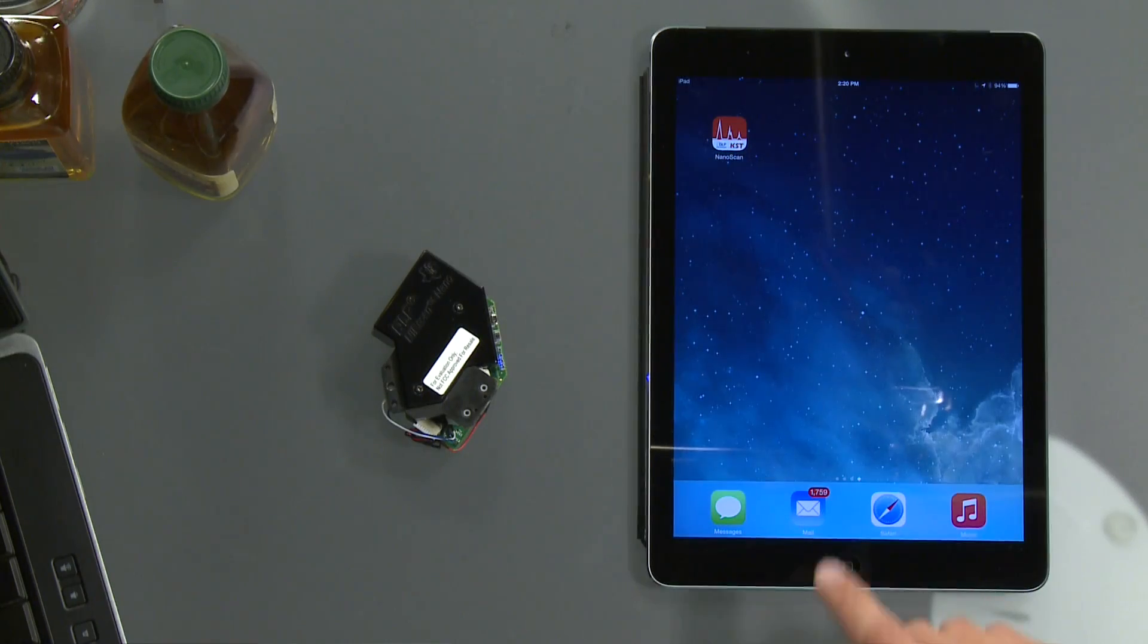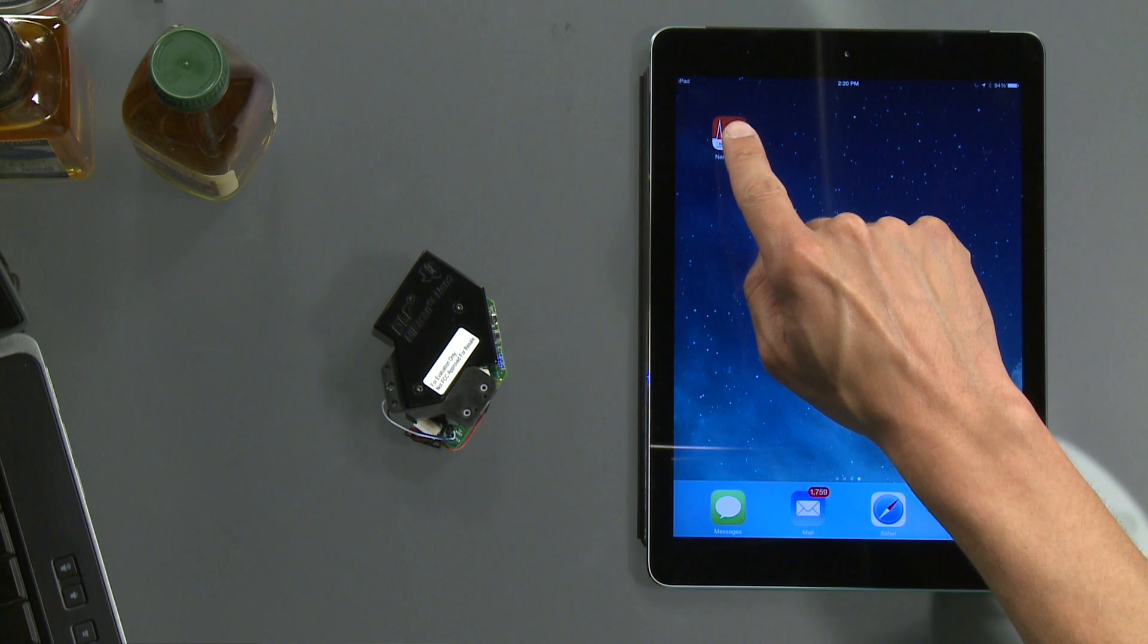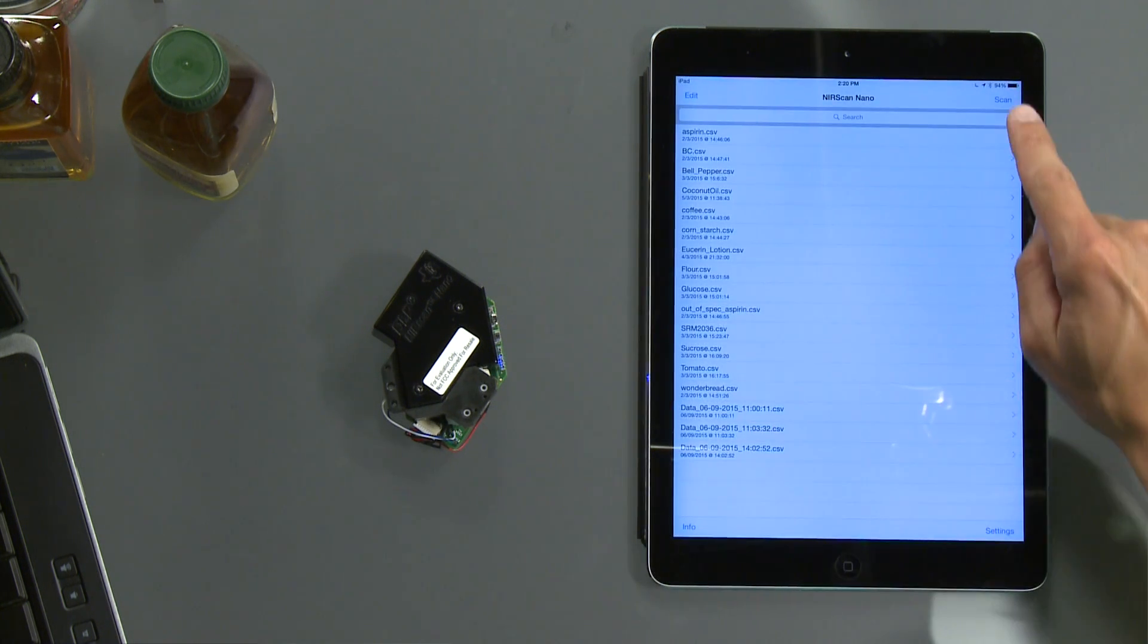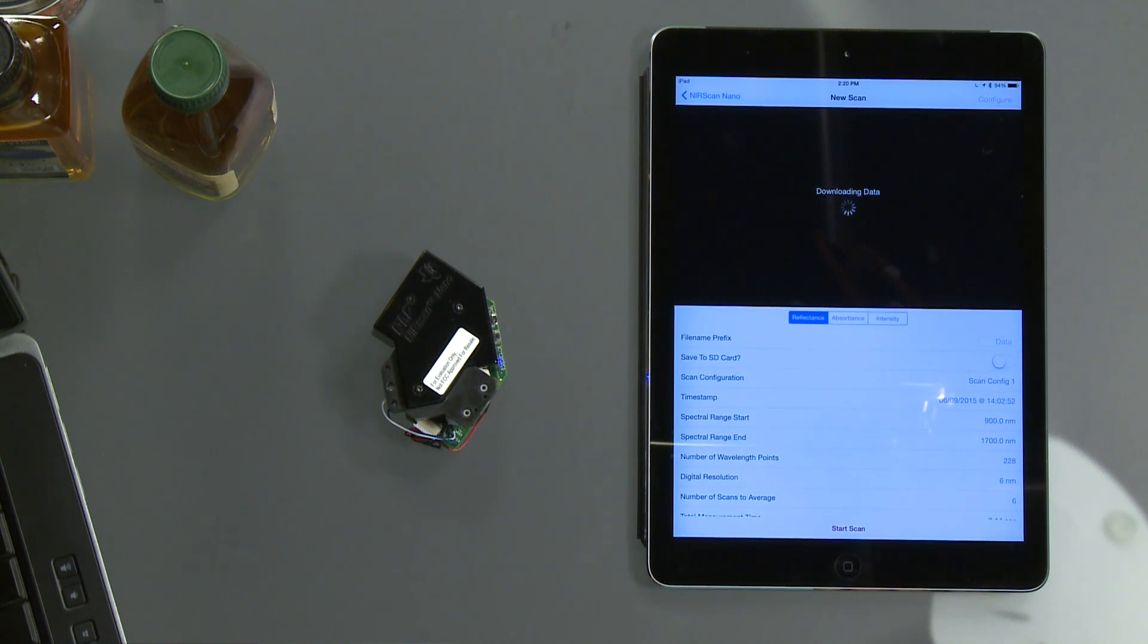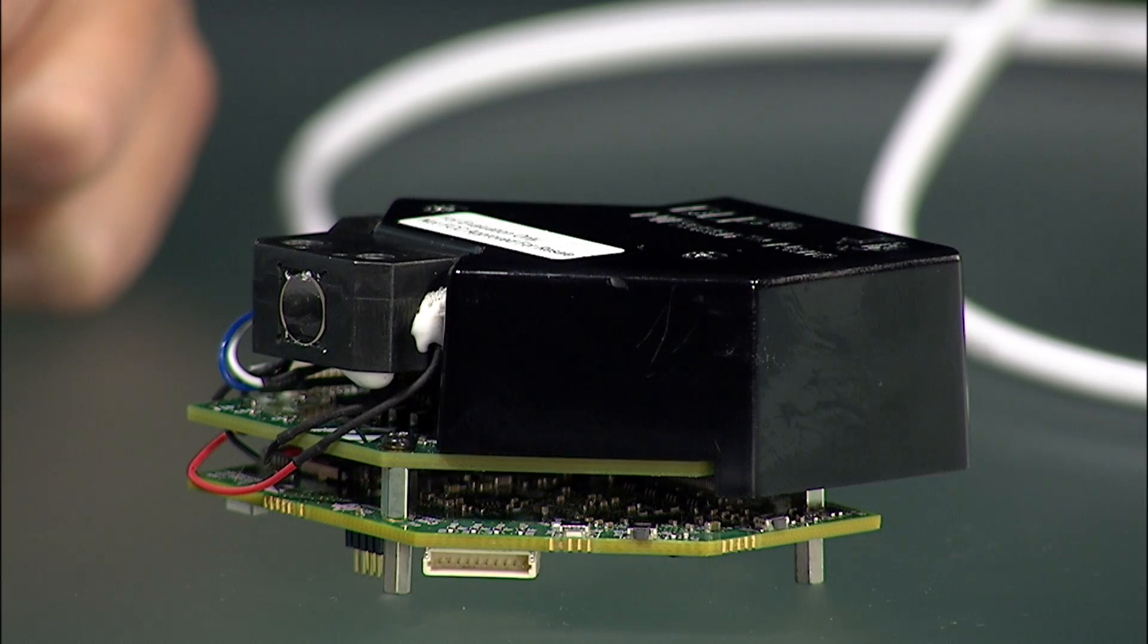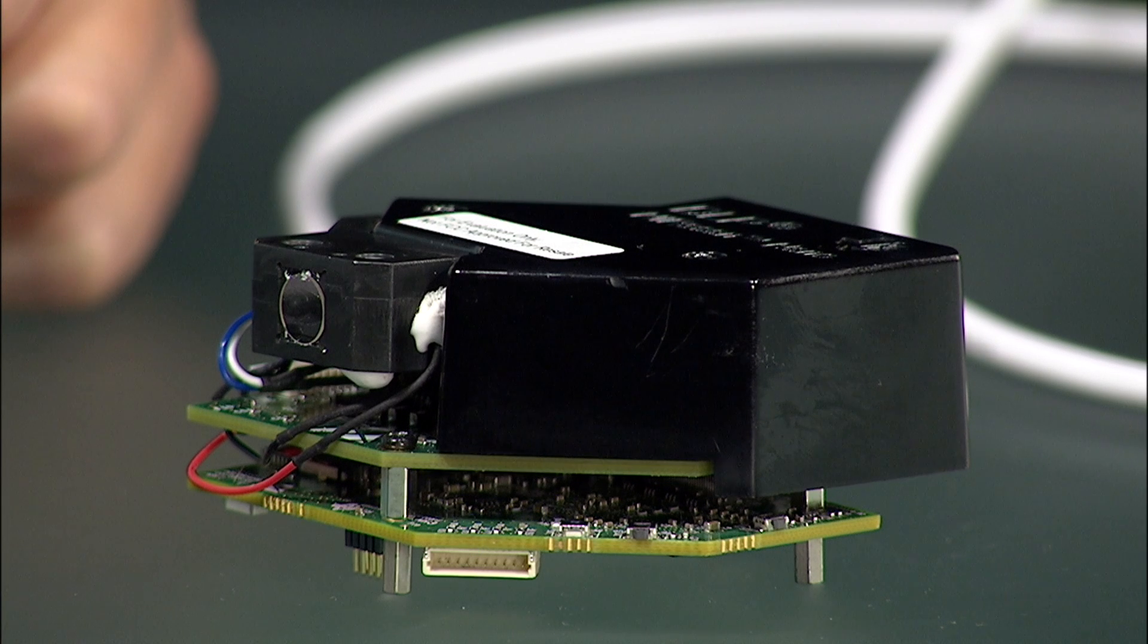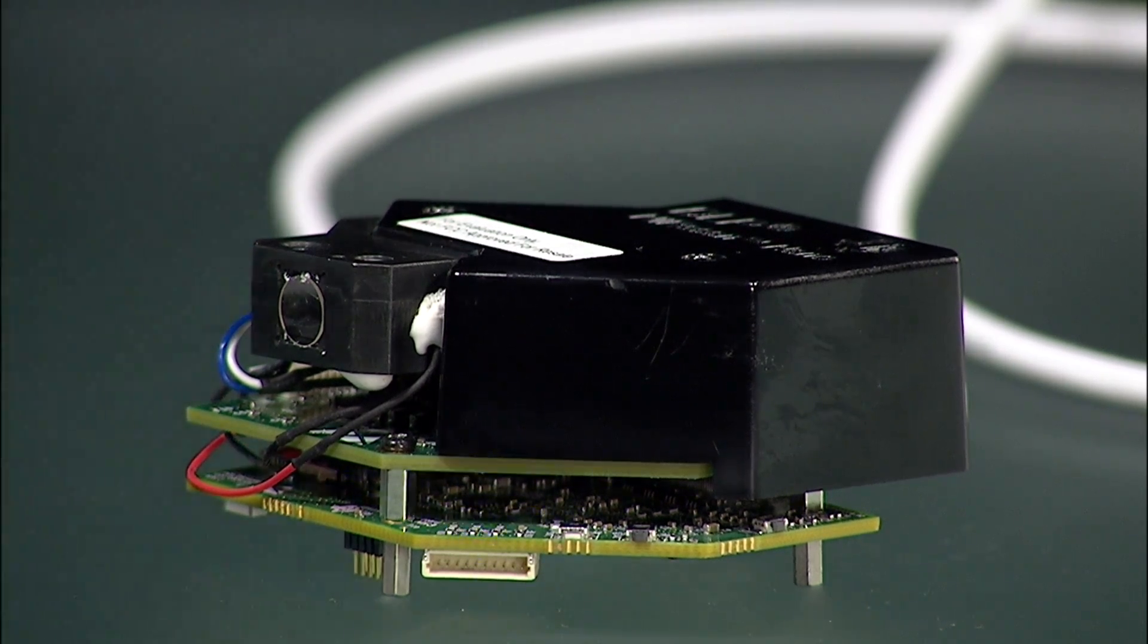If you choose to use Bluetooth connectivity features, you can run the iOS app and click on the Scan button at the top right of the screen. This will establish a connection with the DLP Nearscan Nano. The Bluetooth icon on the top right of the screen will flash. Once the DLP Nearscan Nano establishes a connection, the blue LED will pulse to indicate that the connection was successful.